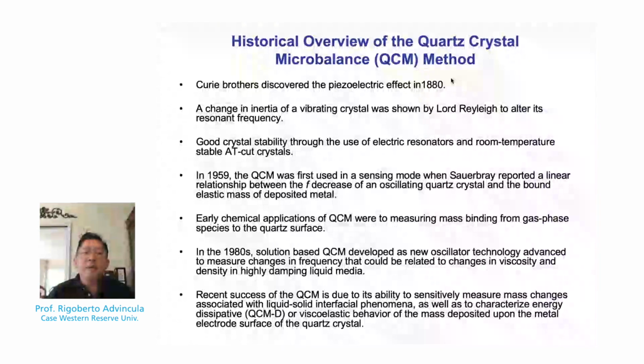However, since then, QCM has been used to measure chemical events, adsorption, desorption, physisorption as well, even in viscoelastic films and media that involve other types of dielectric media or liquids.